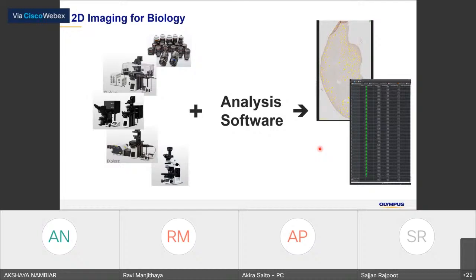So first of all, today's topic is about 2D imaging, 2D segmentation. But of course, in the biological field, we usually use microscopes, like inverted microscopes over here, or maybe upright microscopes, or a confocal imaging system. To have a good image, and also good quantitative information from the biological sample, it needs good optics and good alignment.